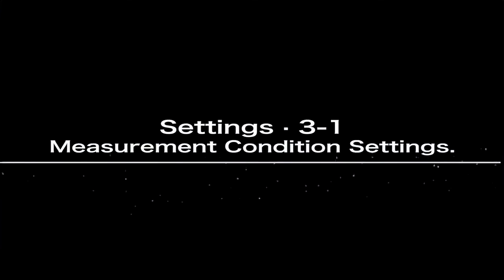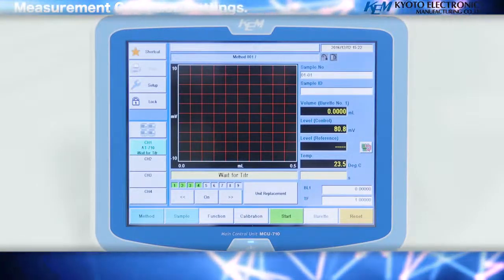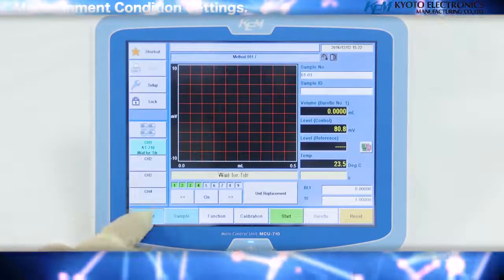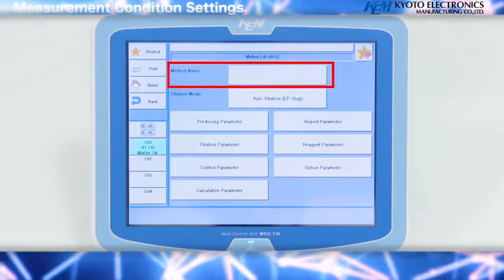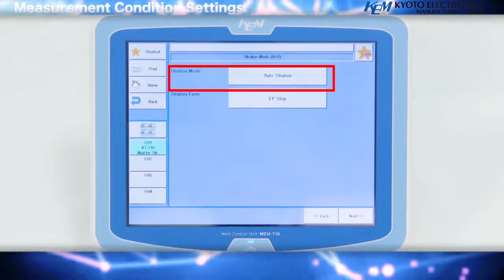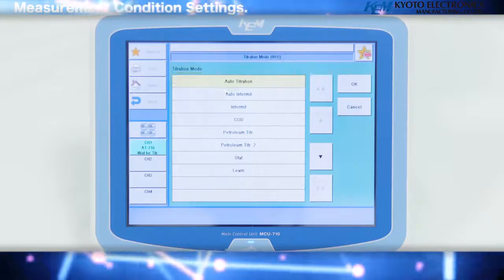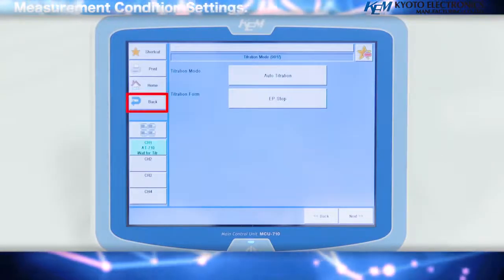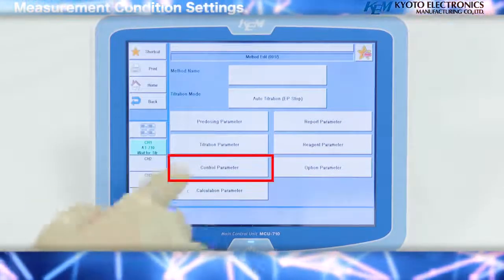Measurement condition settings: we will introduce the measurement method for neutralization via titration. Set the measurement conditions. Press the method key on the screen with the cursor positioned at number 1, then press the edit key. Enter the method name and press the titration mode key. Please select the titration mode. Note: neutralization titrations may be performed with auto-titration. Press the OK key in the upper right of the screen, press the back key, and check the parameters of the settings screen. Then press the control parameter key.